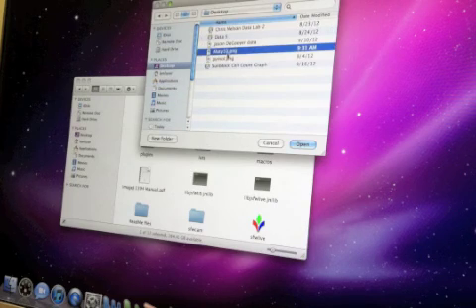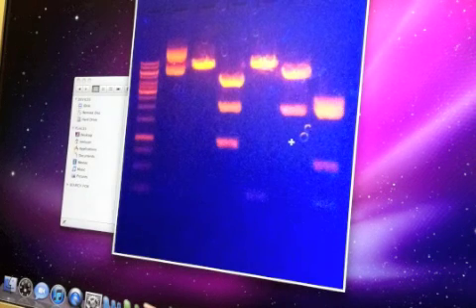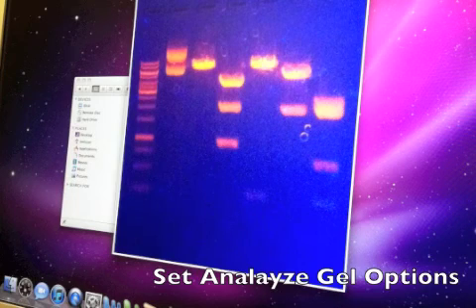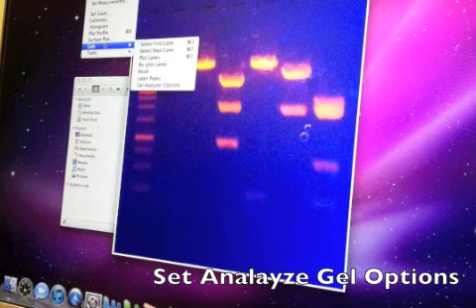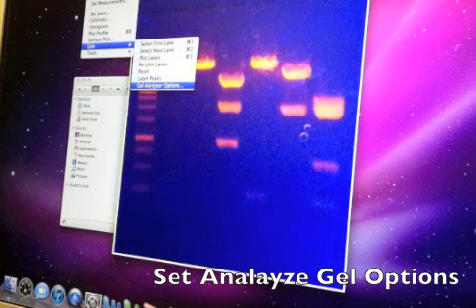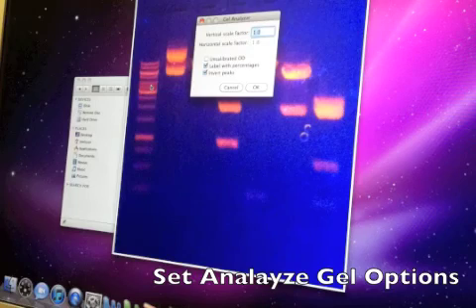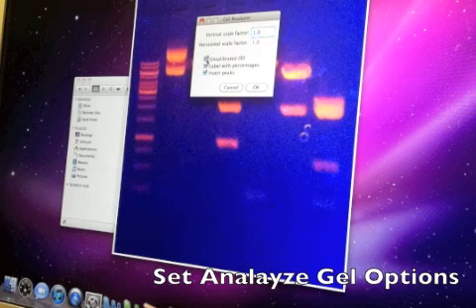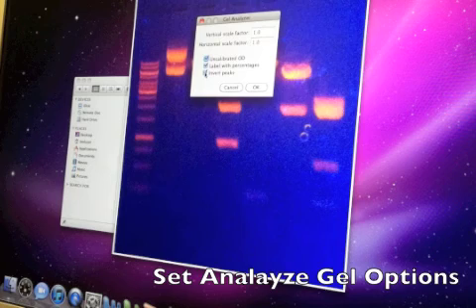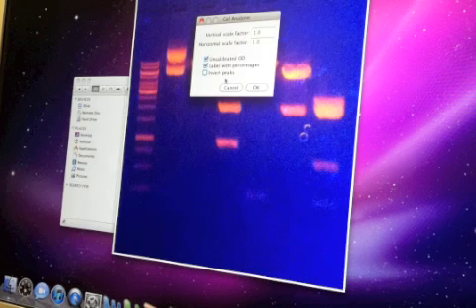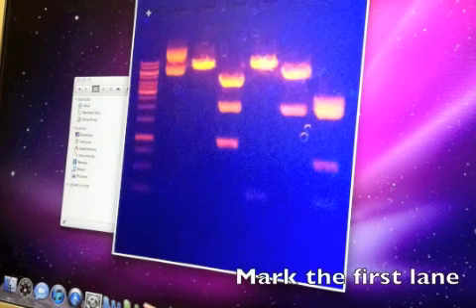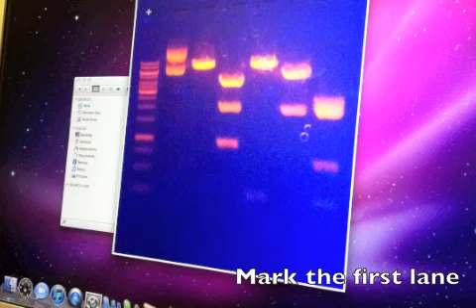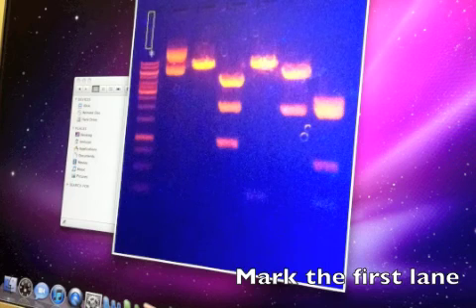Select ImageJ program and then we'll want to open that file that we just saved onto the desktop. Now we can start the analysis. The first thing to do is go to the Analyze Gels menu selection, then Gel Analyzer options, and in here you want it to read Uncalibrated OD. You want to remove the Invert Peaks option.